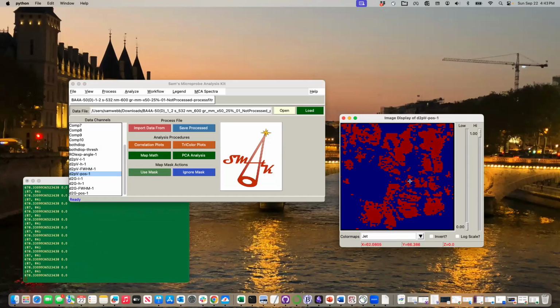Let's see how I did this before here. So it's 664 at the bottom here, and about 667 at the top. So it has about a 4 wave number shift.